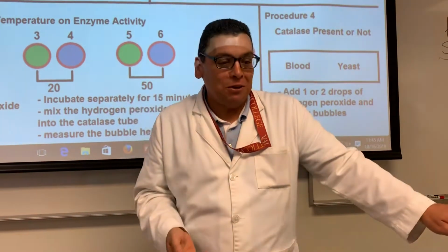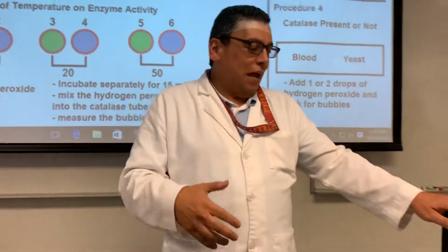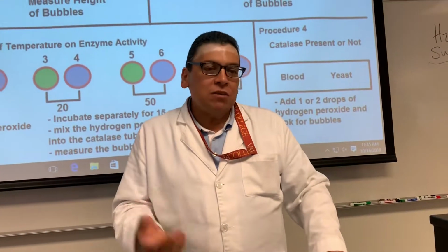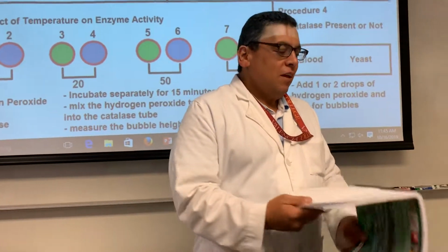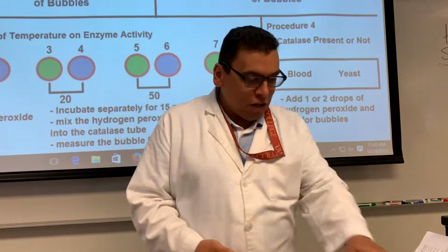Actually, that's what I used to do. Like, that is so cool, right? And the pain sets back in and you start crying again. Well, that was hydrogen peroxide. And why did it bubble? Because you have blood, like the sheep has blood.